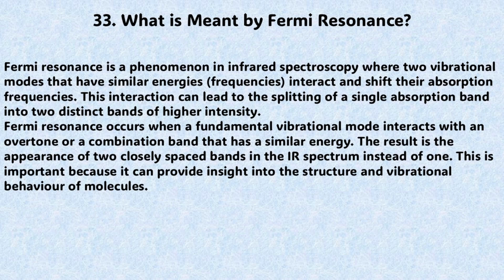higher intensity. Fermi resonance occurs when a fundamental vibrational mode interacts with an overtone or a combination band that has a similar energy. The result is the appearance of two closely spaced bands in the infrared spectrum instead of one. This is important because it can provide insight into the structure and vibrational behavior of molecules.